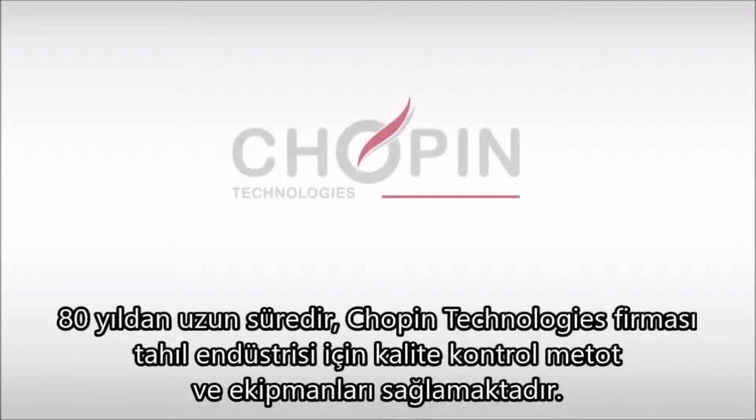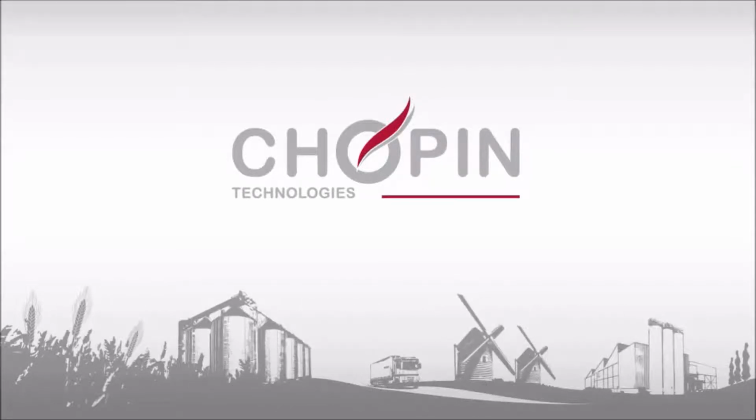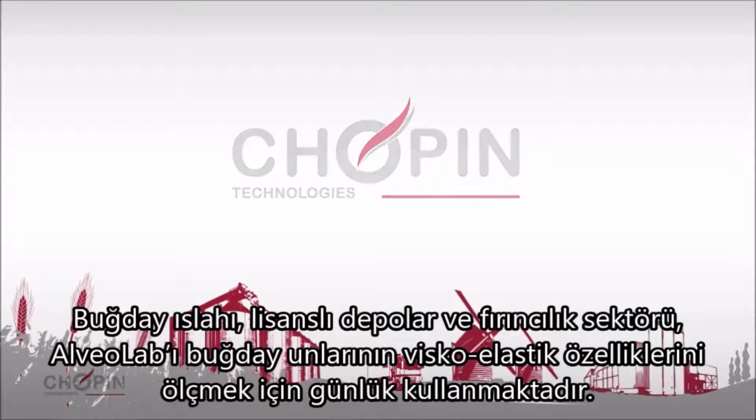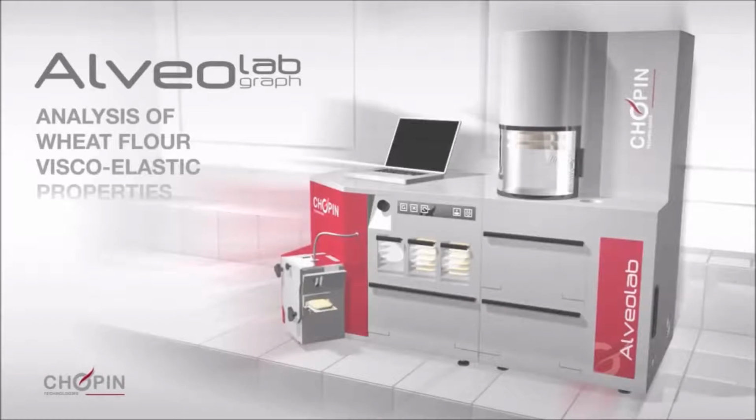For almost a century, Chopin Technologies has focused on providing the cereal industry with quality control tools and methods. Wheat breeding, grain storage, milling, and baking industries use the alveograph on a daily basis to measure the viscoelastic properties of wheat flours.